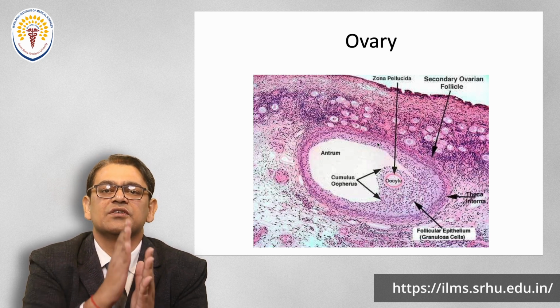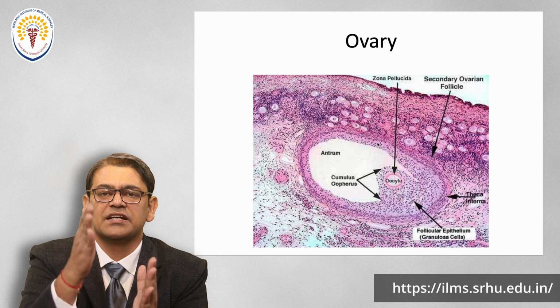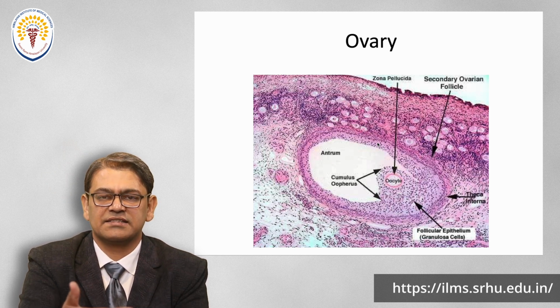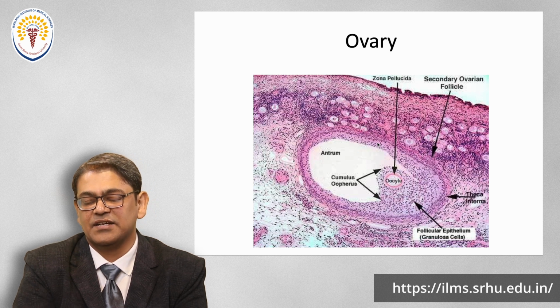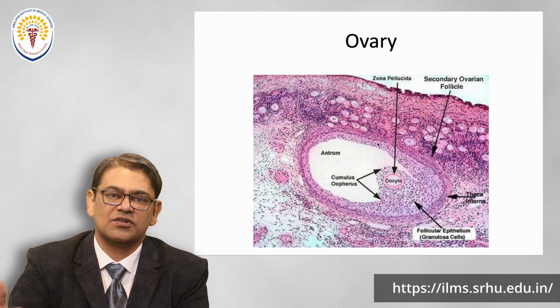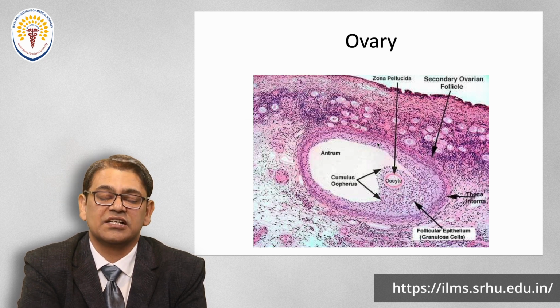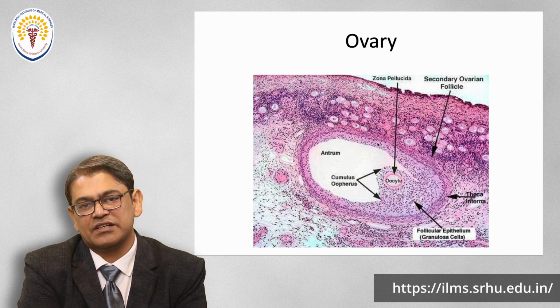So in ovarian histology, it is always required to take continuous sections at a gap, then make the slides and understand them. Only then can you get all sorts of cells in the presentation that give you the complete idea of ovarian histology. So this is the ovarian histology.